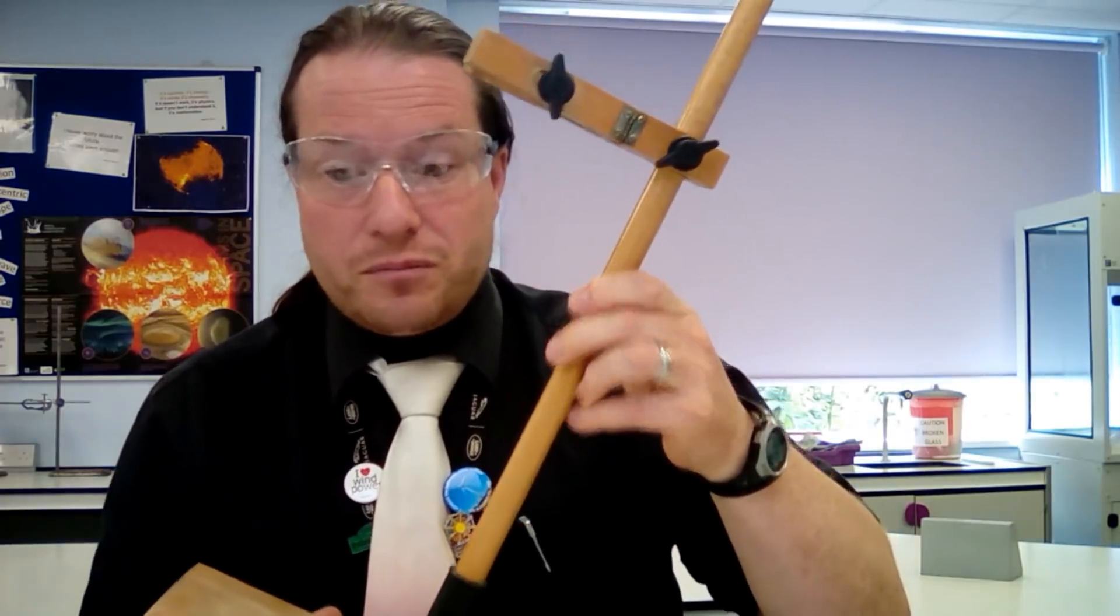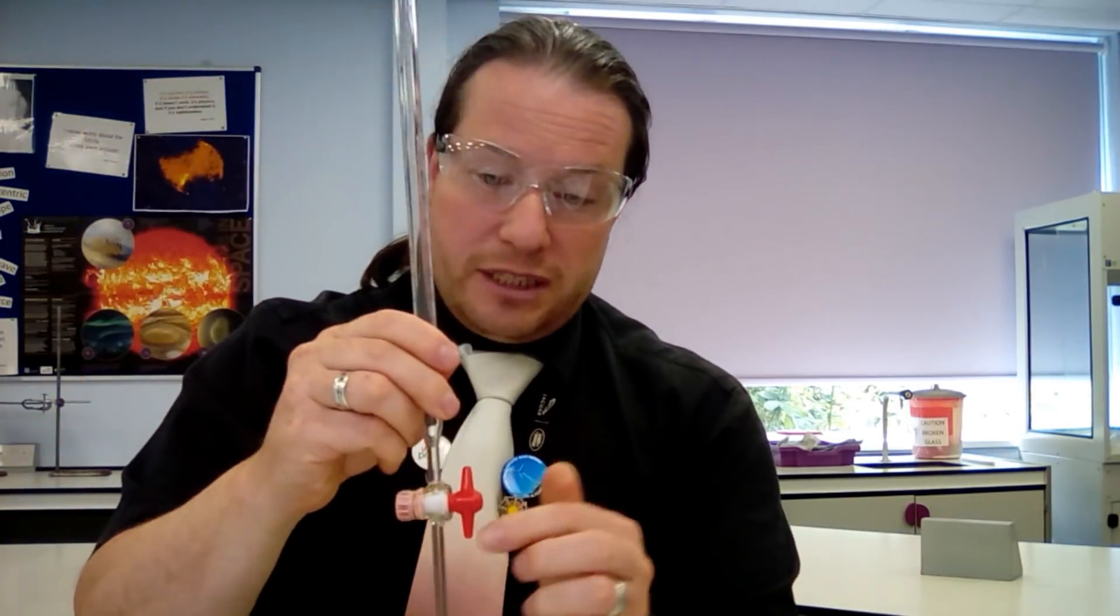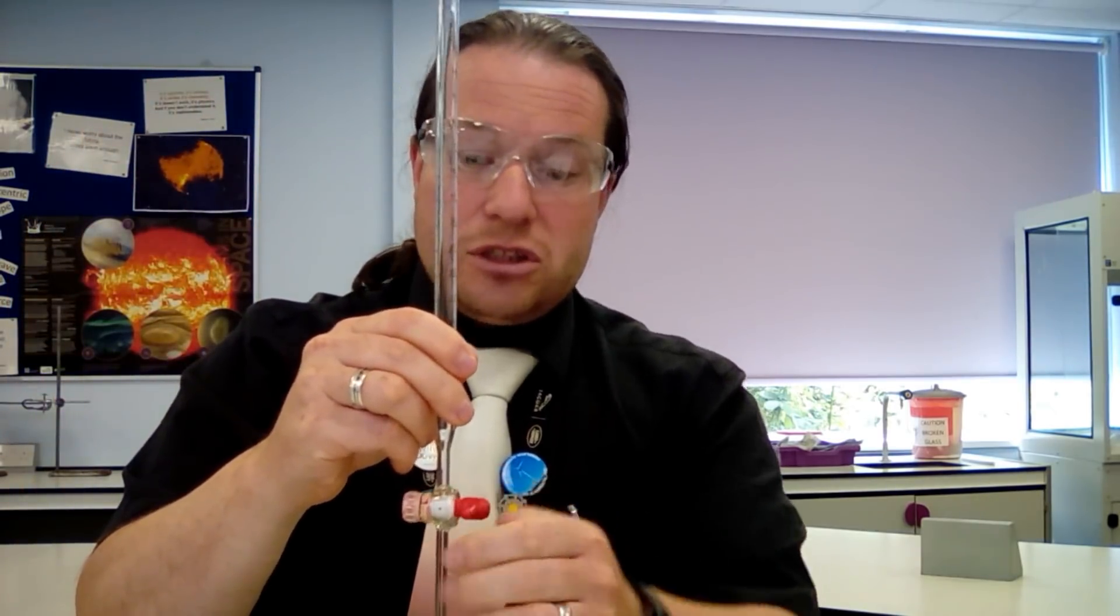We're going to make sure that we wear our safety specs at all times. Equipment that we need: we're going to need a wooden stand, and that wooden stand is going to take our burette. Now a burette is a very accurate measuring device. It has graduations all down here and a tap at the bottom that allows us to control the liquid as it comes out.